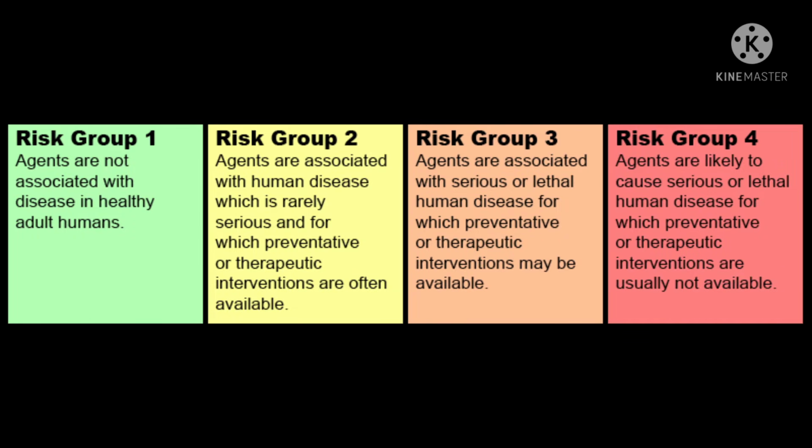Risk group 3 includes microorganisms that are known to cause serious diseases to humans or animals and may present a significant risk to laboratory workers. It could present a limited to moderate risk if these microorganisms spread in the community or the environment, but there are usually effective preventive measures or treatment available. They bring about high individual risk and limited to moderate community risk.